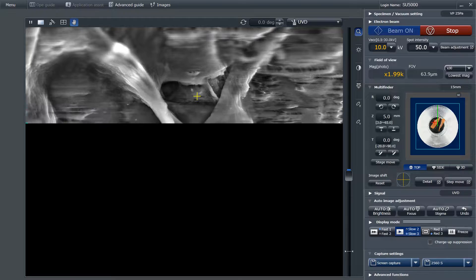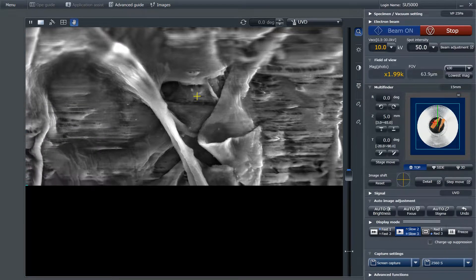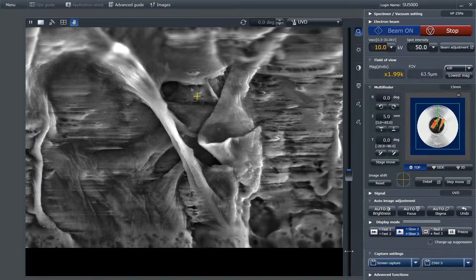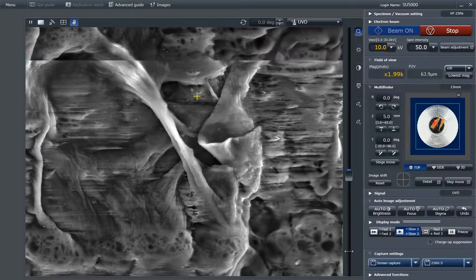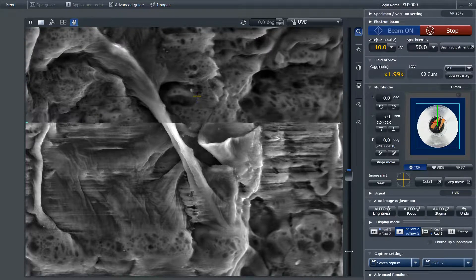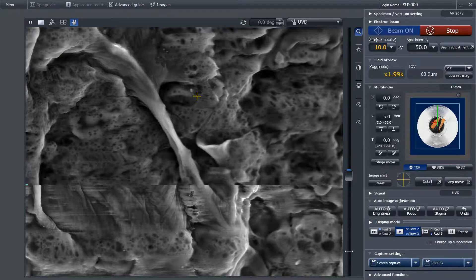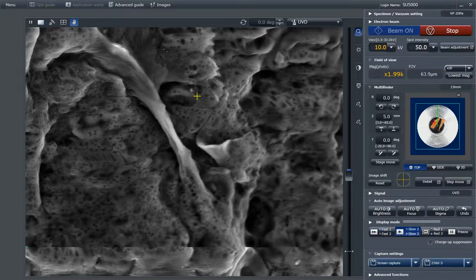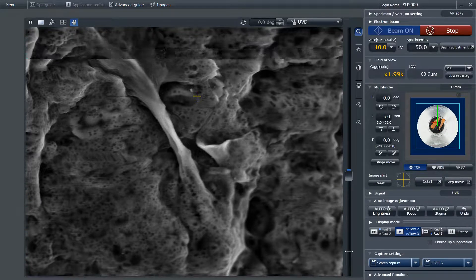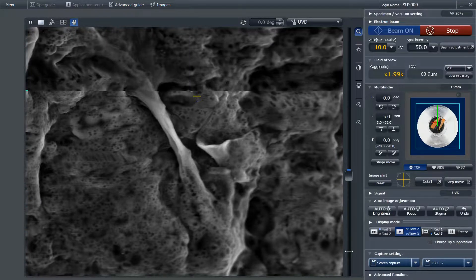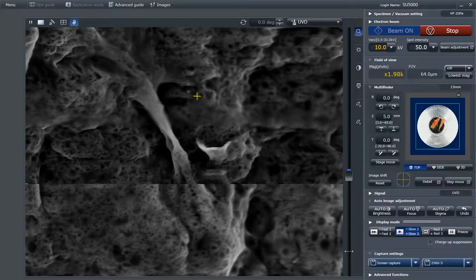Notice how when we look really closely, the radiation actually starts to interact with the sample, and thus you can see the black dots begin to appear on the surface, even though they hadn't before. In a moment I'll zoom in some more to try and get a good picture of them, but it won't really work.